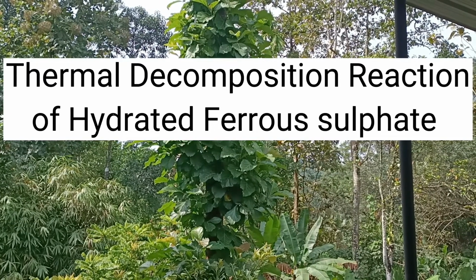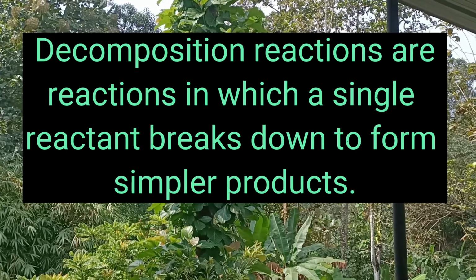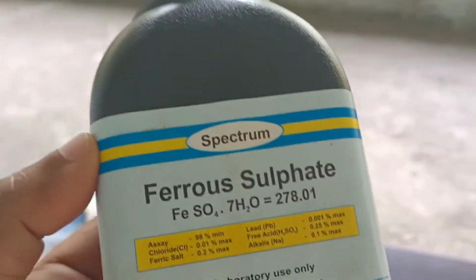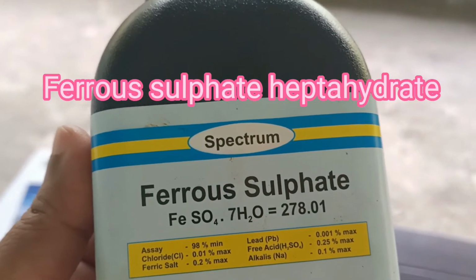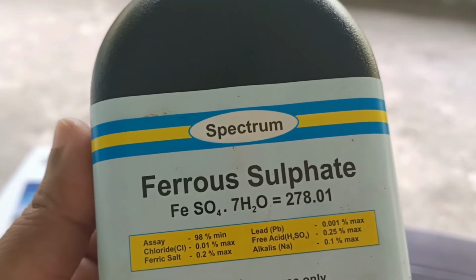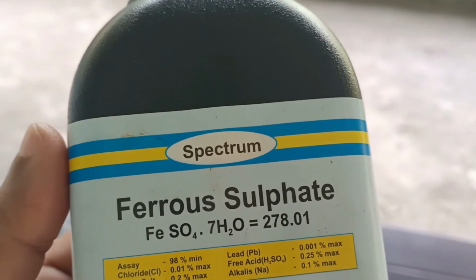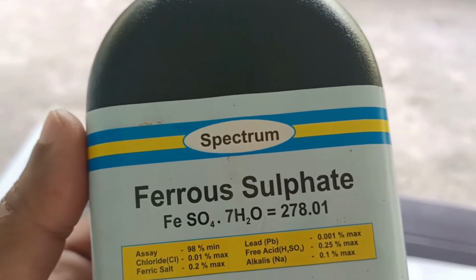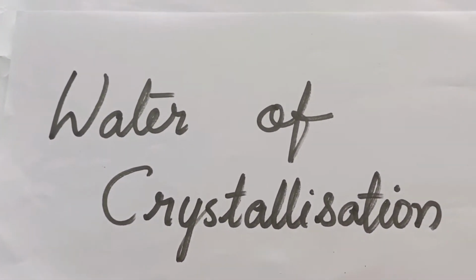So let's watch the decomposition reaction of ferrous sulphate. This is a thermal decomposition reaction, and here we have taken our reactant, ferrous sulphate heptahydrate. Ferrous sulphate exists in various hydrated forms. Heptahydrate is one among them. That means it contains 7 molecules of water in its crystal lattice. These water molecules are known as water of crystallization.